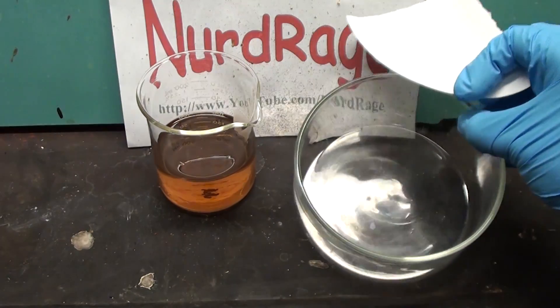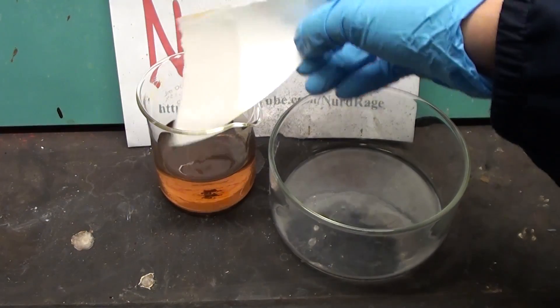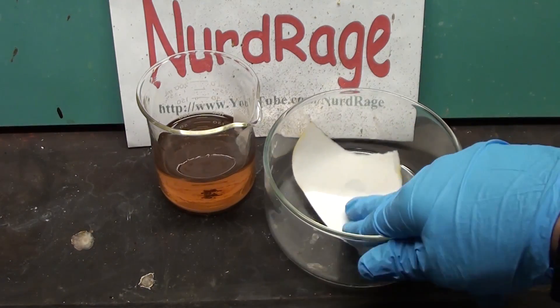Now get a sheet of filter paper and wet it with our solution. This is our test paper and must be freshly made as the rhodosinate decays after about an hour.